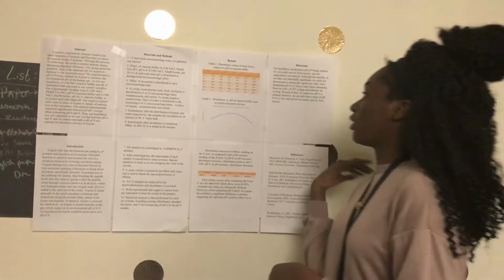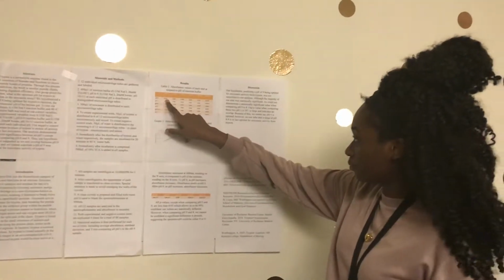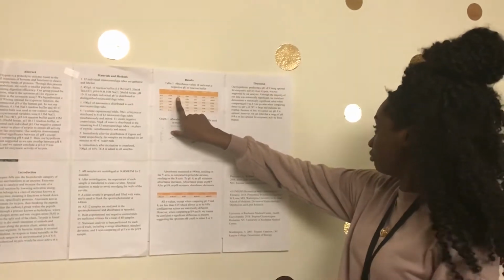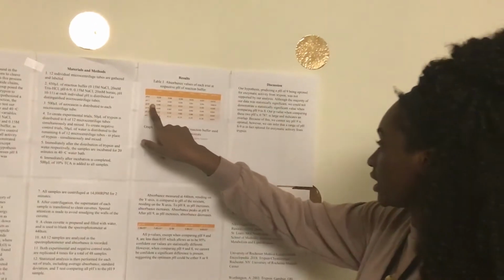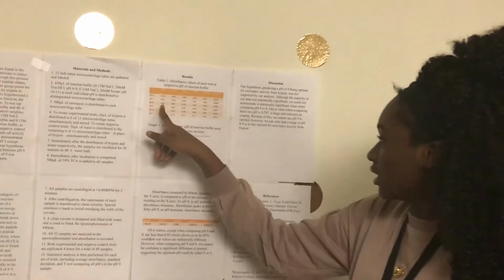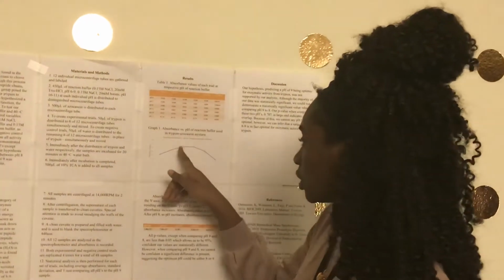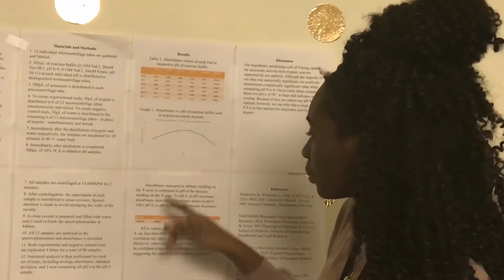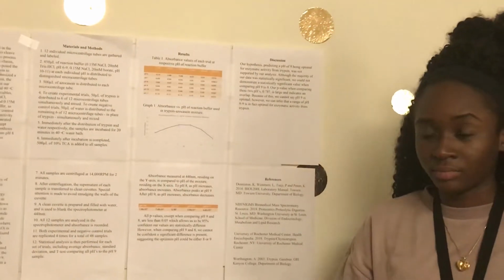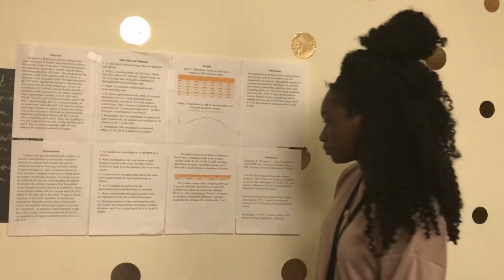Now, as we can see in our graph, from pH 6 to pH 7, there's a really huge difference, which is the same with pH 10 and pH 11. But when we come to pH 8 and 9, we can find out that there's no significant difference, which also shows in the graph because these levels are in the same range. So we couldn't say which one of pH 8 or pH 9 is the best pH level for trypsin to act on azocasein.